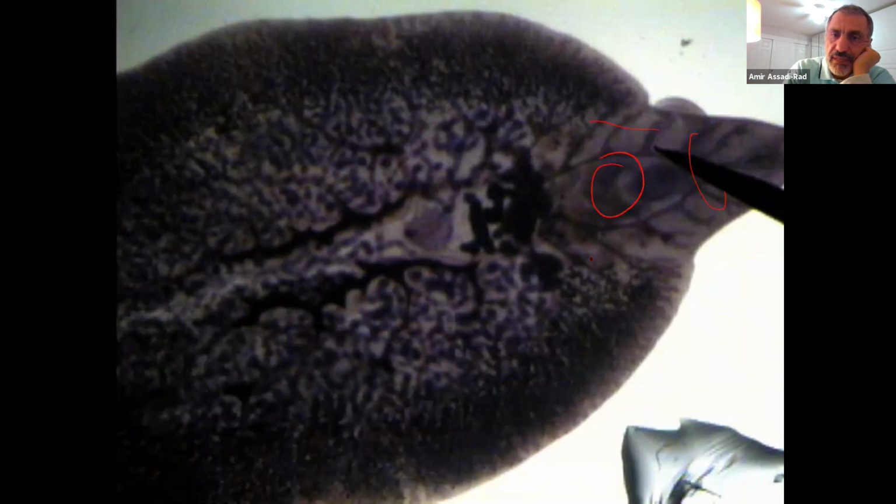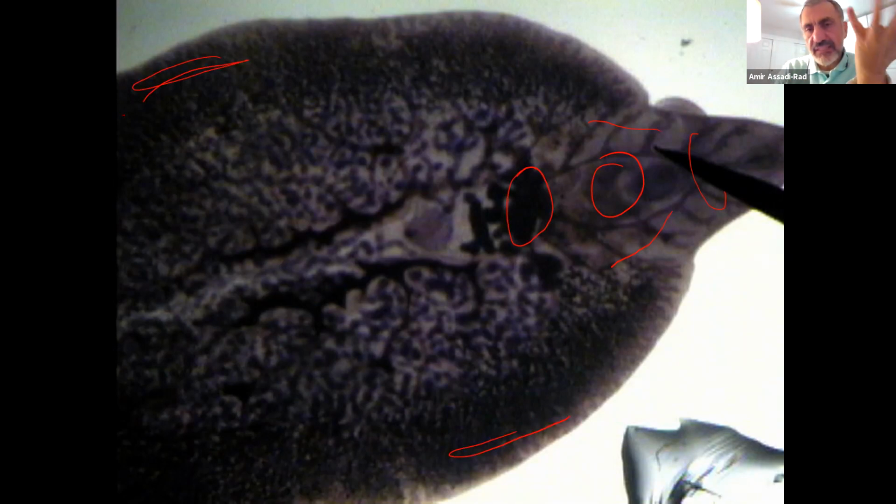And these are all cecum, and this would be uterus, yolk glands right here, yolk glands right there, and that's about it. In some species, if they stain them, you can see the egg nicely. Maybe in some of these you can see the eggs in the uterus area.